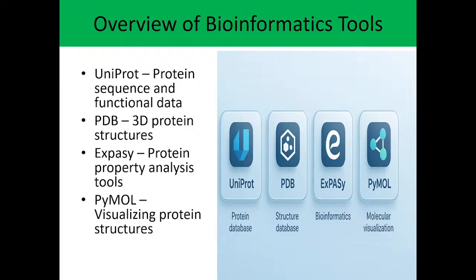The next one is Expasy, which has to do with analyzing protein properties. We are going to make use of that. Then PyMOL. PyMOL is a tool for visualizing protein structures.